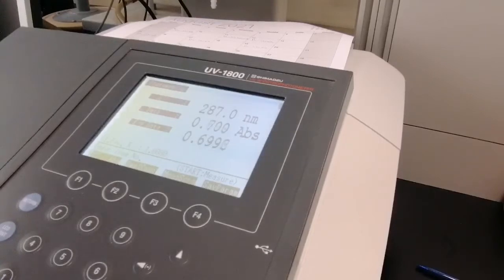Now this is the end of the practical part of this experiment. To know more about the calculations of the experiment, you need to watch the theoretical part again and do your calculations, plotting the absorbance versus concentration with the dilution factor calculation, in order to calculate the concentration of mefenamic acid in different buffer solutions, and study the effect of co-solvent and the difference in pH buffers on the solubility of mefenamic acid and whether it is enhanced or stays the same.